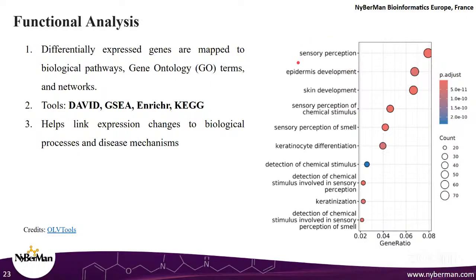Okay, so the tools that help us do this are some things known as DAVID. There is something known as GSEA, which stands for Gene Set Enrichment Analysis. There is something known as Enrichr. These are all R packages or UI tools which actually help us perform these analyses.